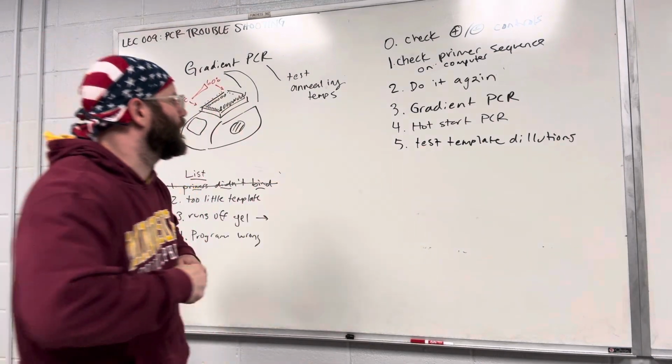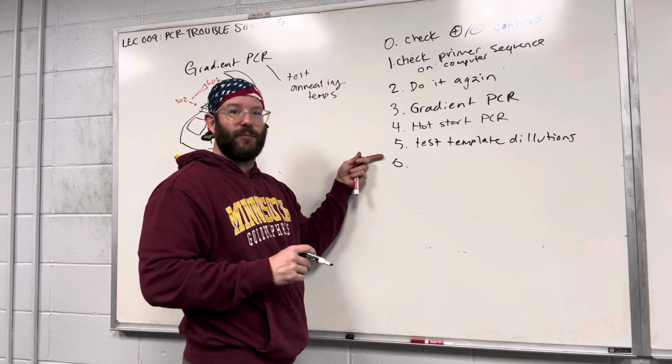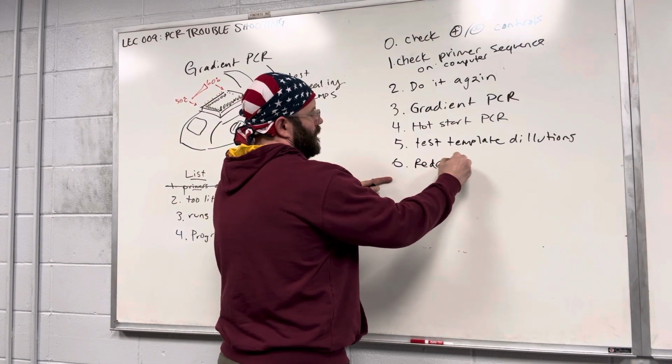If you get to this point, you've done all these things and your PCR is still not working, I would redesign the primers.